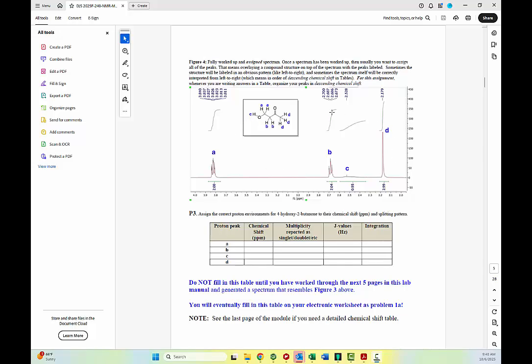When you see a proton spectrum worked up and you see how much information is contained within that spectrum, there's no surprise that a table describing that spectrum likewise contains a lot of information. Specifically, if you are looking at a worked up spectrum, the integration, the most important information, is contained down here, but you also have chemical shift information up at the top, and of course, there's multiplicity information, which you can tell by looking at the peaks, and if you are good, you can use the information up here to extract the J values.